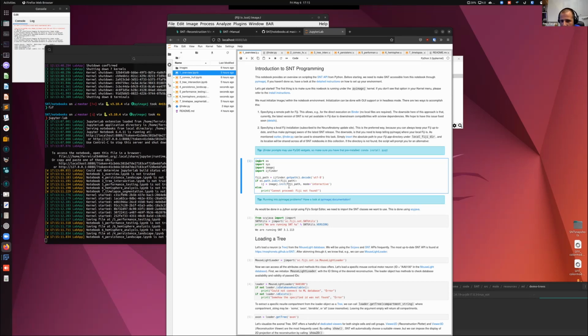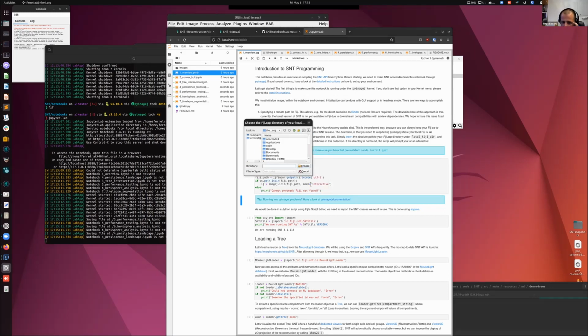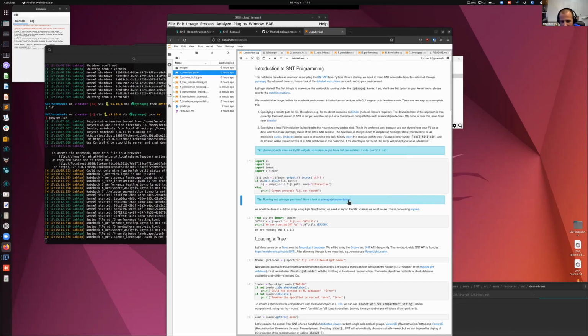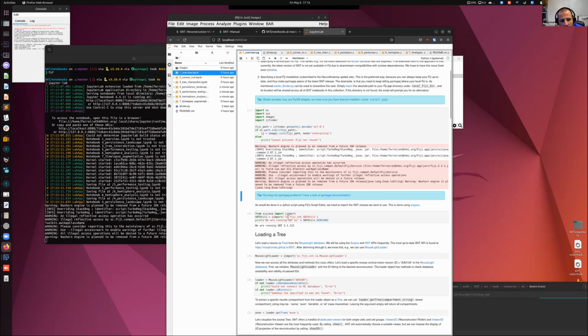And if it doesn't find it, it's going to prompt you to do so, which is kind of a neat thing, which is what I have here. So in this case, I'm just running. It says, okay, the default path, which was in your home folder, I couldn't find it. So where do you have it installed? And you see that I have it in a different place. And now you can specify it, and the script now should run. So it's kind of an extra level of convenience. It takes a little bit to initialize, and you get some warnings. Okay, and now you have access to SNT.